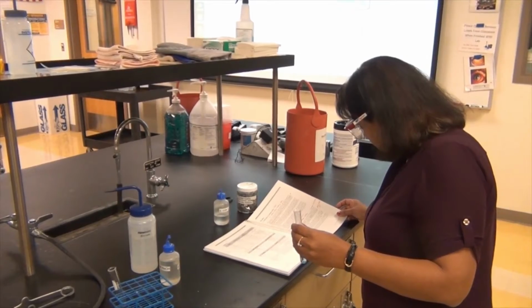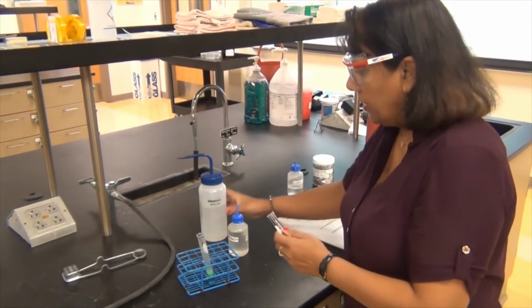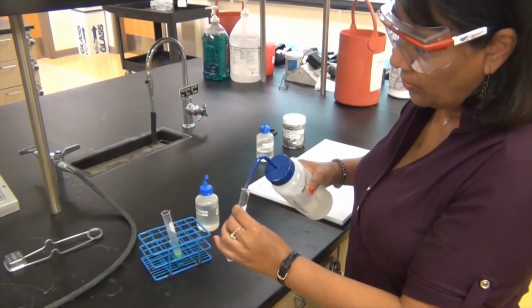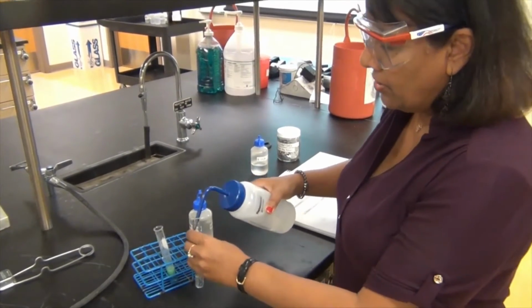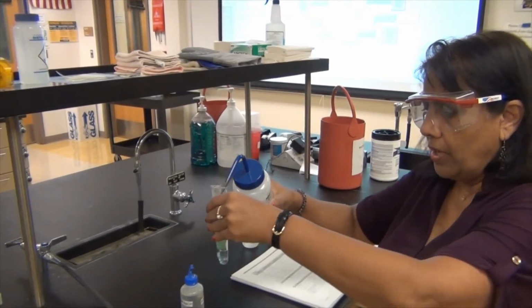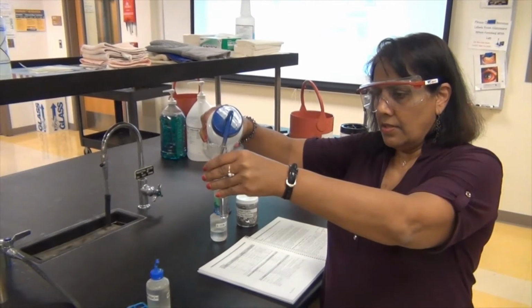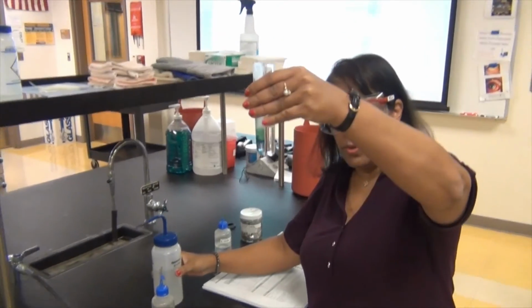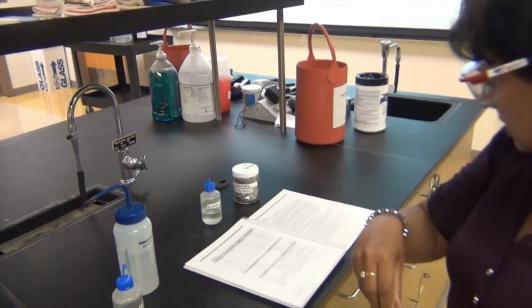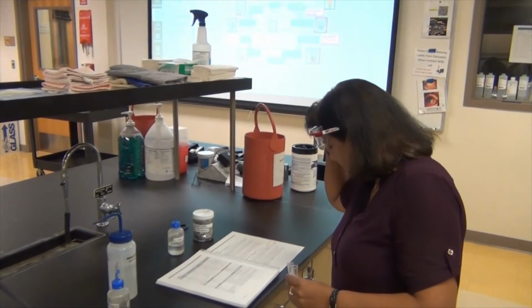At this point, for this, I need to take an equal amount of water, because in a centrifuge, you need to balance with the amount of water. I'm just taking distilled because it's close to me, but otherwise you don't really need distilled water. You just need to make sure that it's just about the right volume. I'm really sorry that you are not going to be able to use the centrifuge. I think this is the only lab where you use a centrifuge, so you're going to see me use it. Here is the amount, so all equal to go. And we're going to centrifuge this for about a couple of minutes, I think. Let me see, 30 seconds to 1 minute.